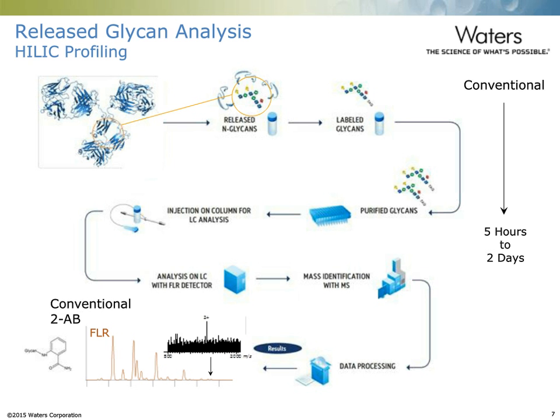Unfortunately, conventional approaches to the preparation of N-glycans for HILIC, fluorescence, and mass analyses are either laborious and time-consuming or have required compromises in sensitivity. For instance, deglycosylation is very often employed as an overnight incubation and then combined with a lengthy 2 to 4 hour labeling step based on reductive amination. And in the case of one of the most frequently employed labeling compounds, 2-aminobenzamide, the resulting glycans can be readily detected by fluorescence, but be rather challenging to detect by electrospray ionization mass spectrometry. And this is because of their poor ionization efficiency.